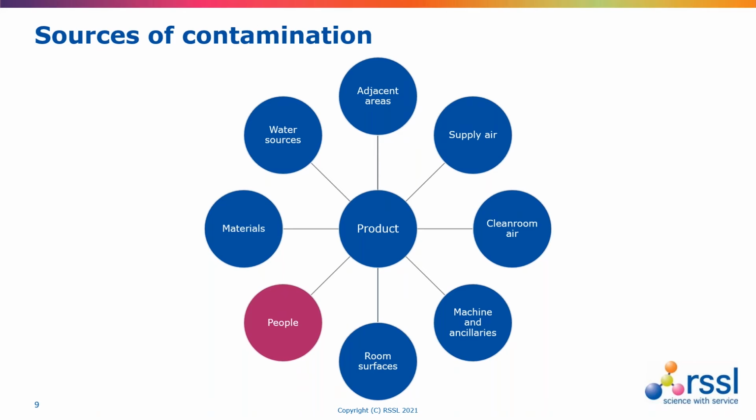The other thing to bear in mind is that we shouldn't really be considering these contamination sources always in isolation, because contamination often occurs in combinations. So for example, if you take a clean room, contamination could potentially arise from air, people, and from equipment during the same work session, maybe in different proportions, but it could be from the same contamination event.